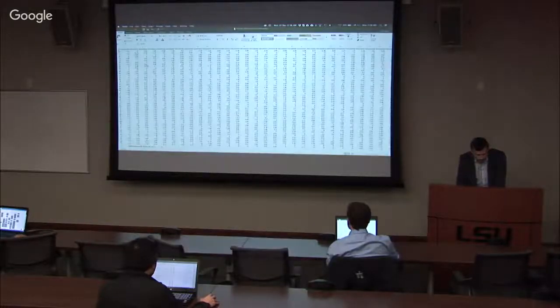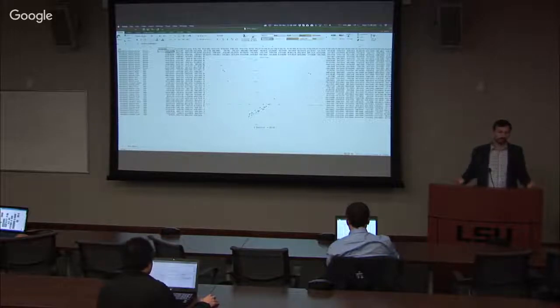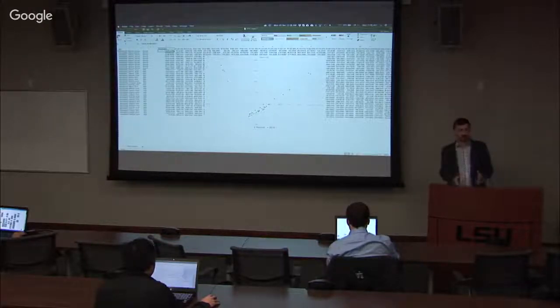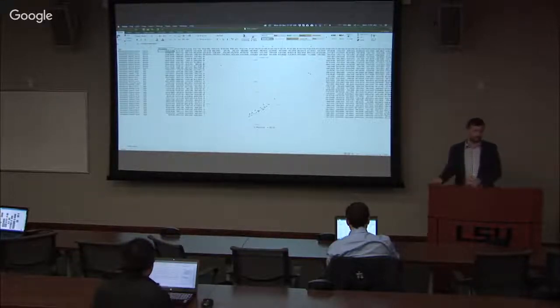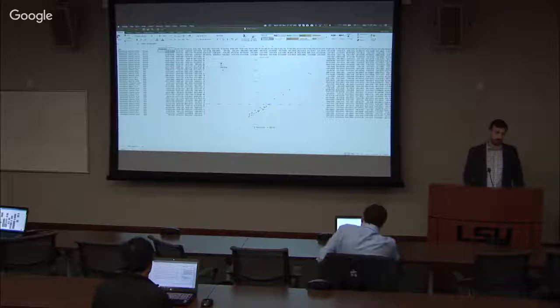So what is it that we're seeing in the PCA result over here? This number is impossible to interpret in gene expression values. It's just something that tells us something about the variance between all the samples. So it's unique to the data set that we're studying, but it's not really interpretable back into gene expression values. There is a way to do that, which we go through in transcriptomics too, where you can use these projections and do reverse projection and actually interpret how genes that are responsible for this sample being way out here, how do I find those genes?